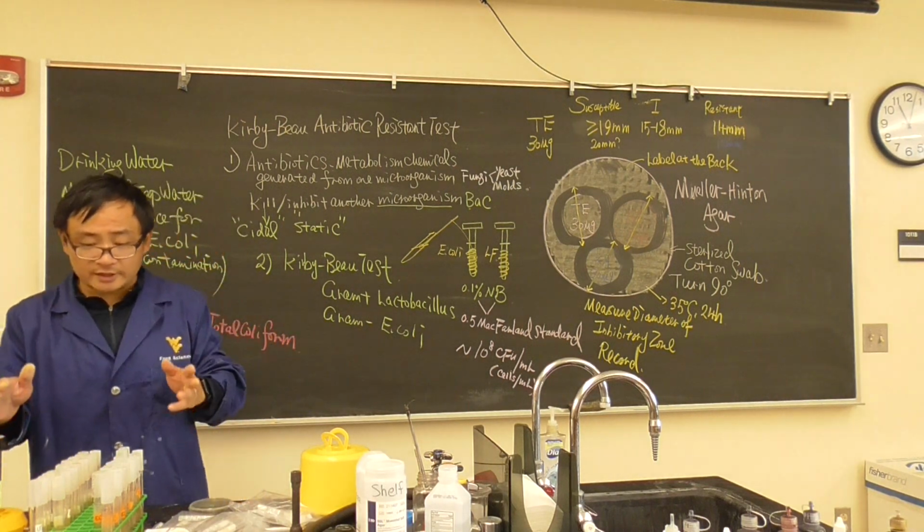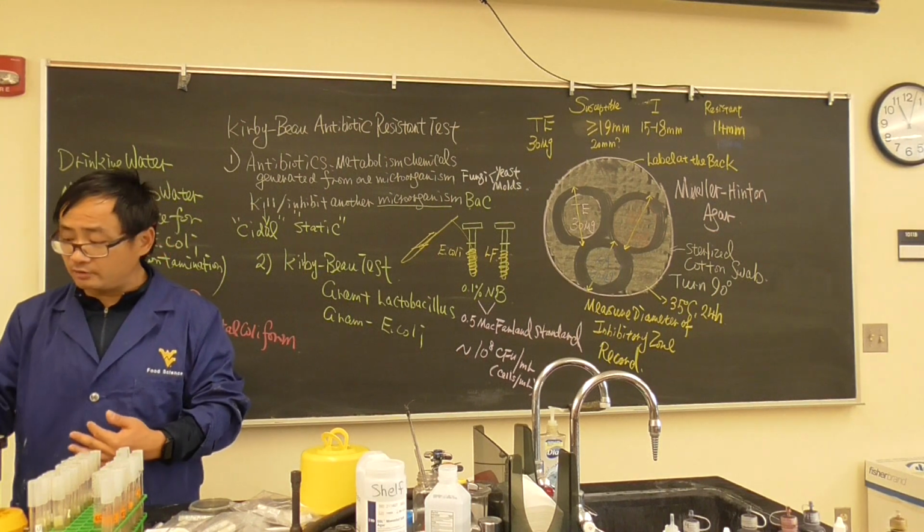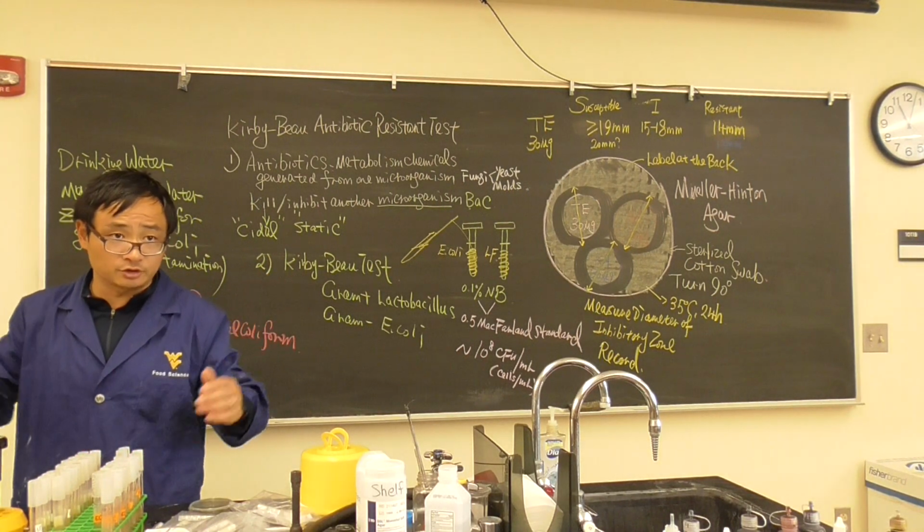I have different antibiotics right here compared to this table. Not everything is covered, but I will have a full table for you next week, Tuesday.